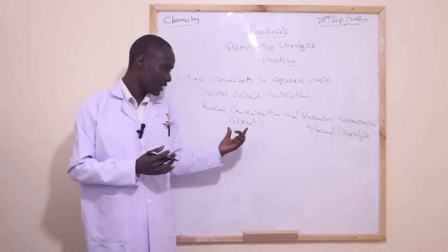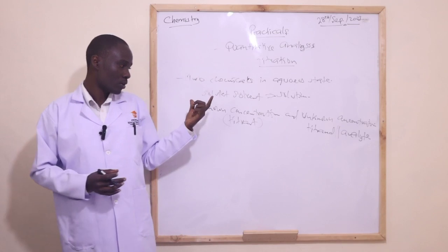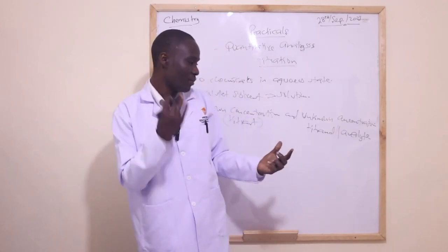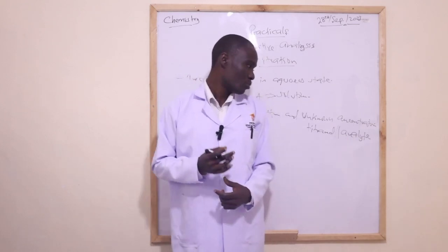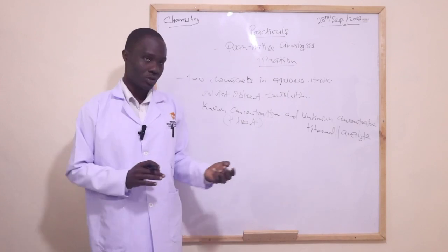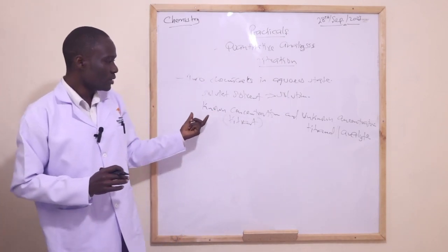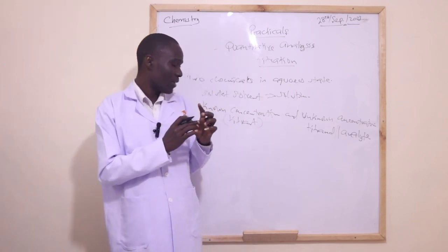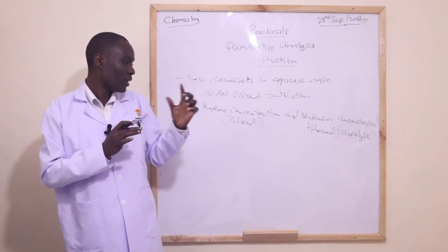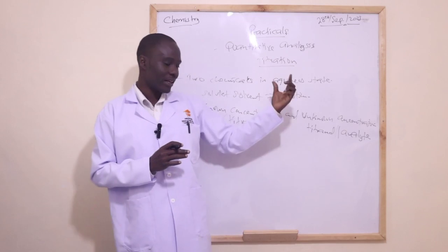When I mention titrant, your mind should be on the known concentration. When I mention analyte, you should know that I'm referring to the unknown concentration. We shall have a case study, and we shall label both our titrant and our analyte.